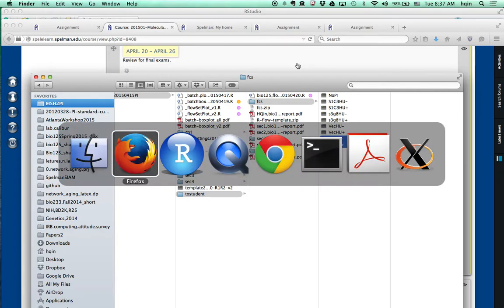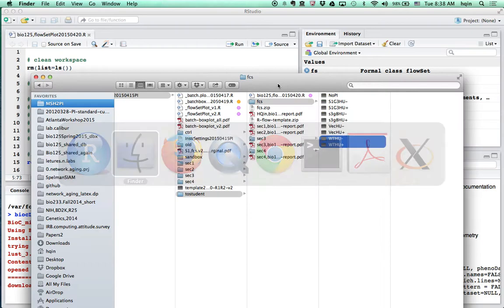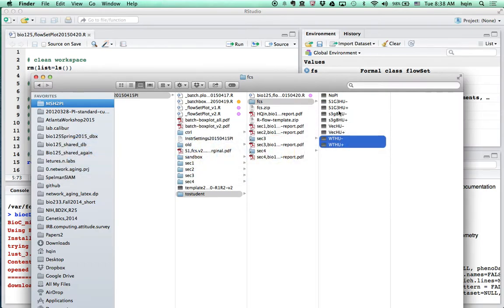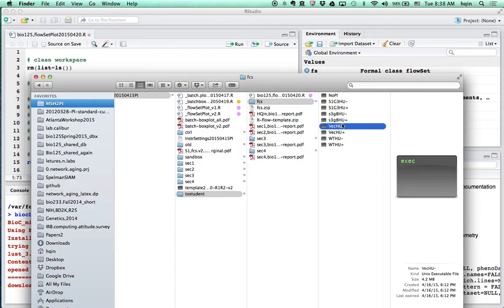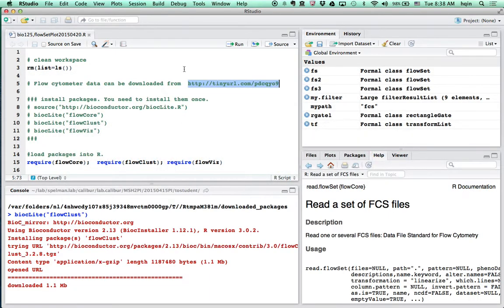But you can download your own flow cytometry data from the shared Google Drive. The link is in R3 here. Once you download those flow cytometry data, you can select your own section data and put it into the fcs folder. That's how your data will be analyzed with the wild type and vector control. Once we have that, go back to RStudio.